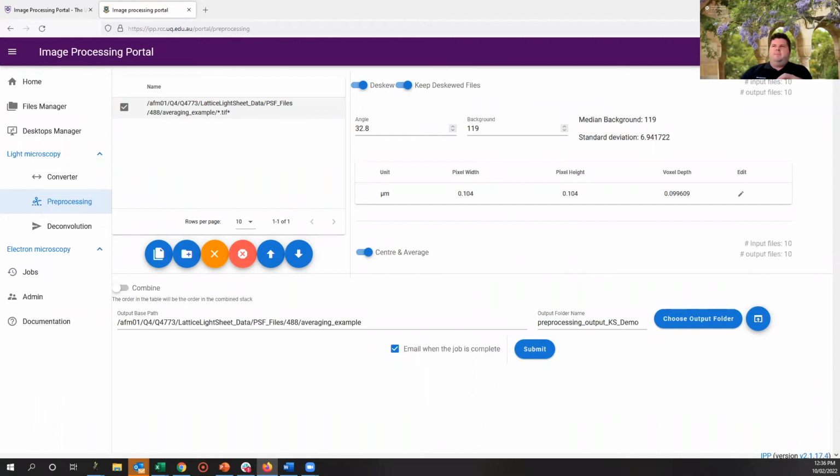Now, I will say that our system's pretty robust, and we tend to not have to bin whole data sets. Where it can be useful is when you're capturing a very long time and you're looking for discrete events within that. So you can definitely create MIPS, and there are tools like Napari that are doing that kind of single frame processing. Where this benefits is that it can do the HPC processing faster. So what used to take us days or weeks to process, it can take seconds now.